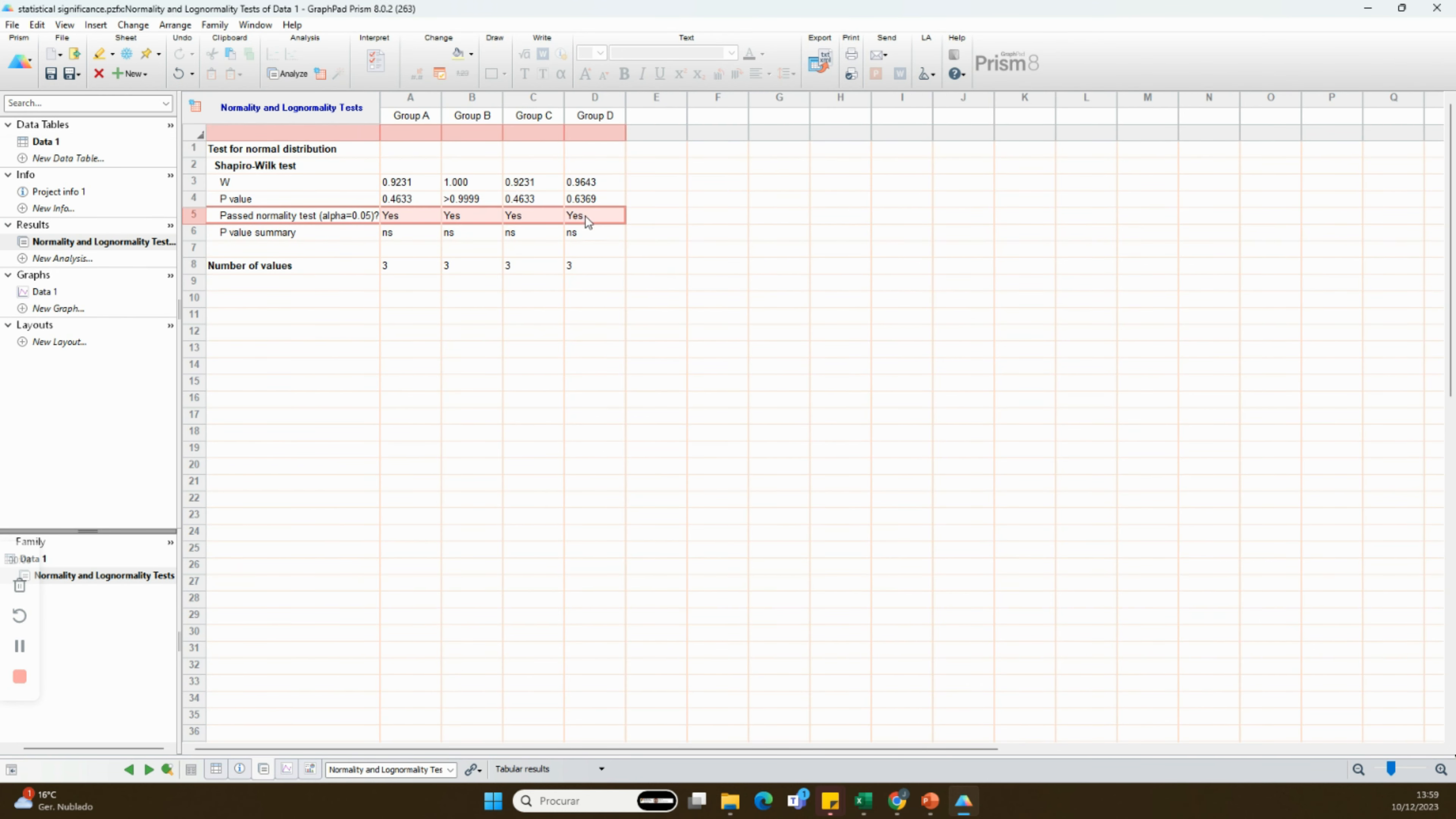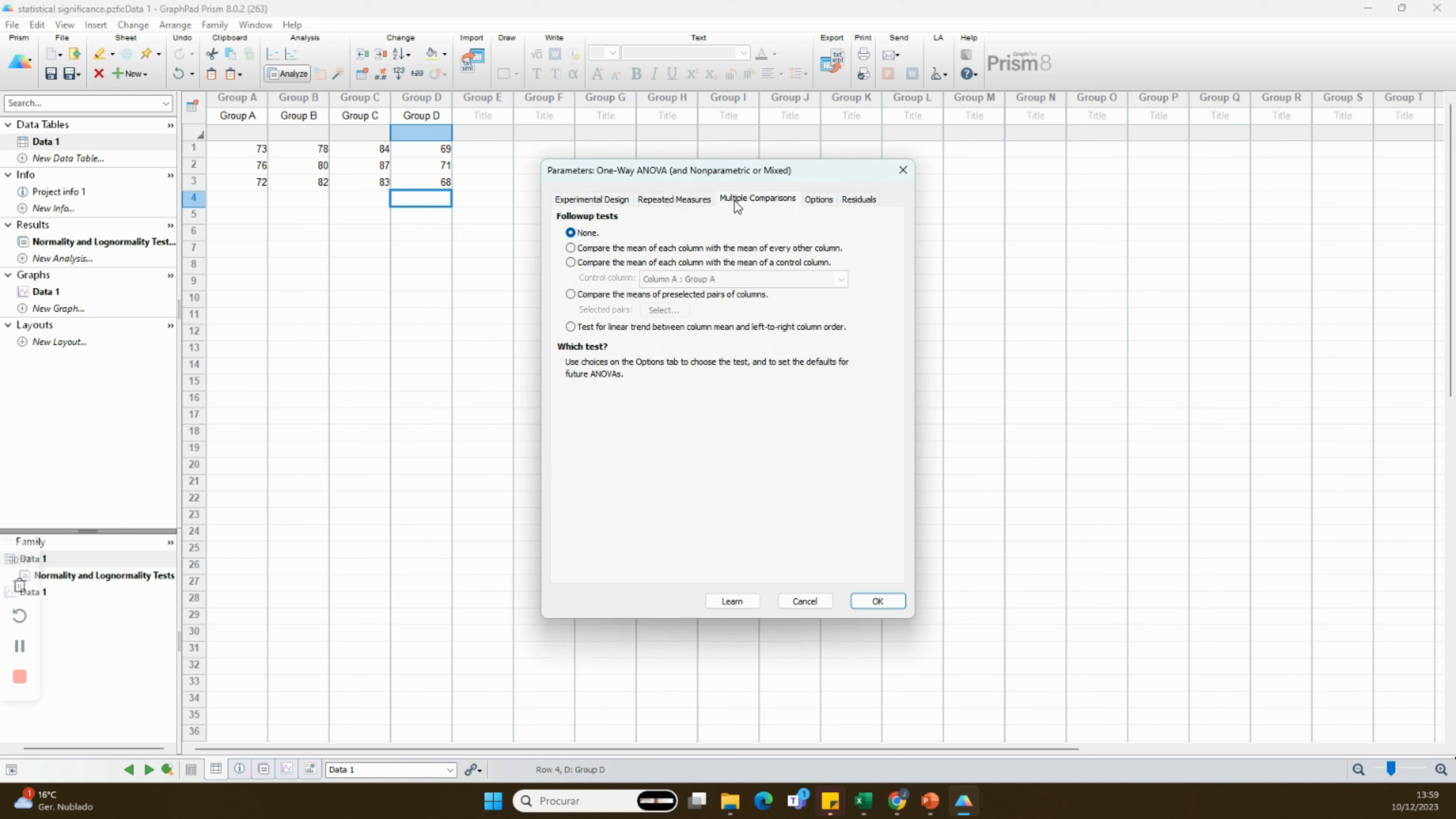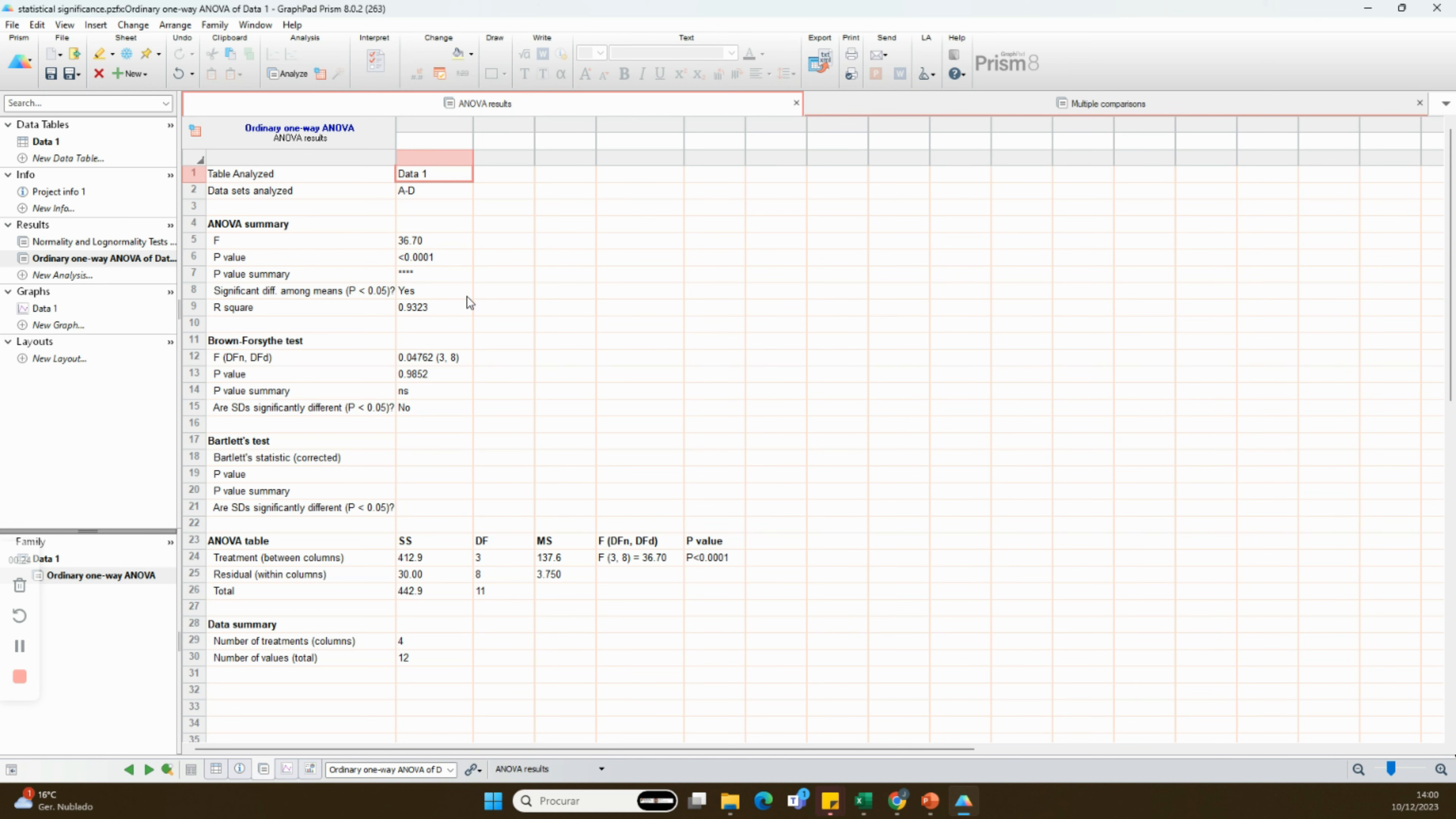Whether you have your data in a spreadsheet or another format, Prism makes it easy to import. Click on File, then New, and choose the type of data you're working with. Import your data set, and let's move on.